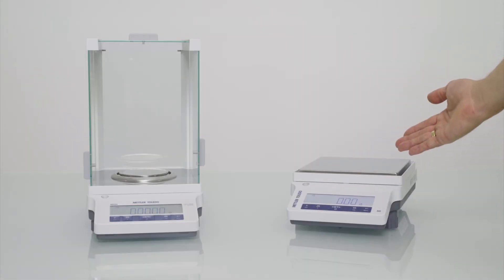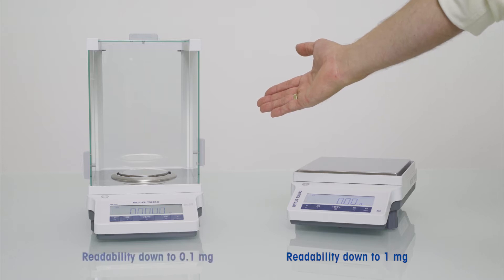Let's have a closer look. The balance on the right side is an example of a precision balance. Precision balances have readabilities of down to one milligram. On the left side you can see an analytical balance. Analytical ME balances have a readability of down to 0.1 milligram.